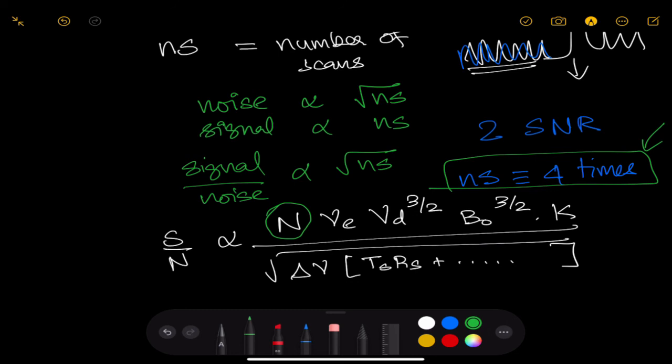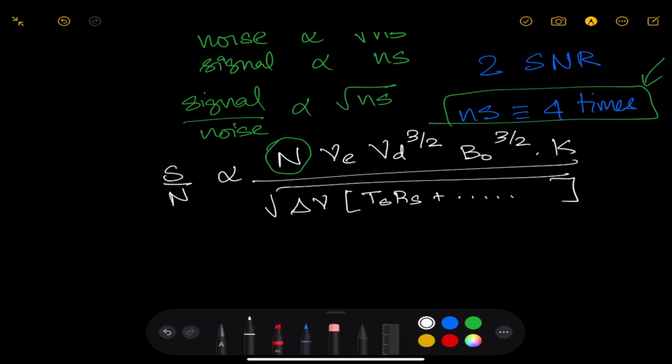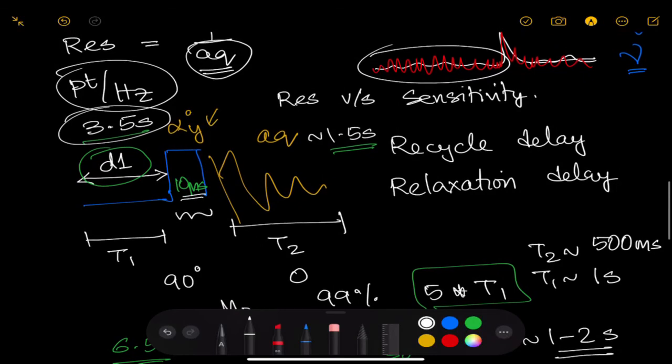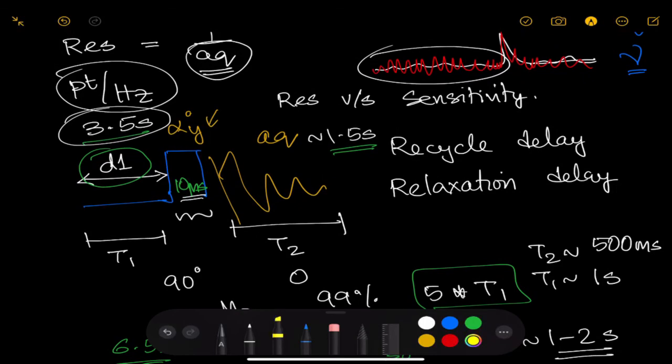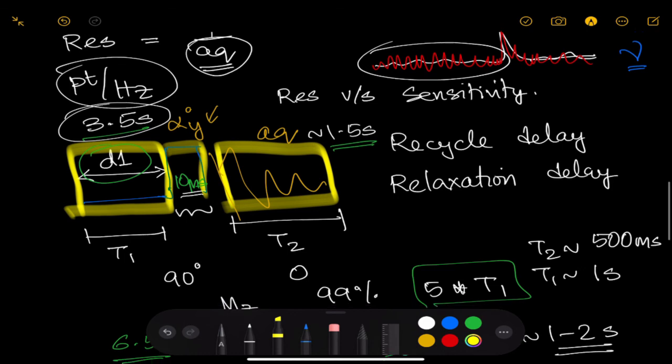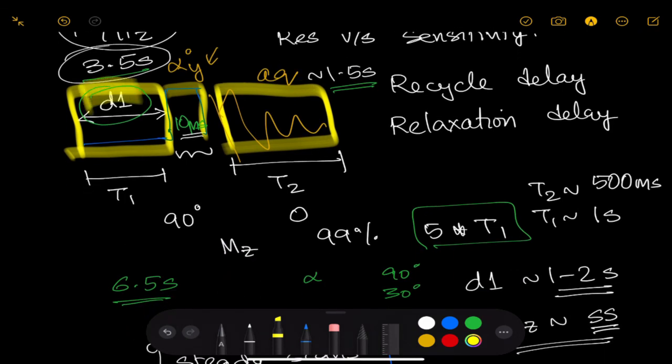I hope this entire lecture has given you an idea of the different modules that are present in an NMR experiment. Namely, you understand what a recycle delay is and how following a pulse the signal is acquired in terms of Nyquist sampling. In addition, how these various parameters of the recycle delay and the acquisition time are set. At the same time, you also try to understand how noise ends up playing havoc if you keep acquiring signal forever.